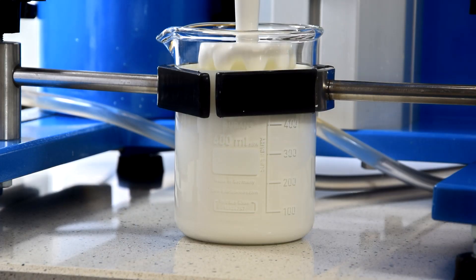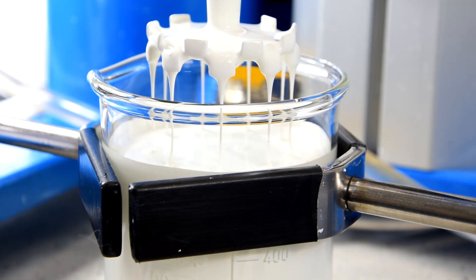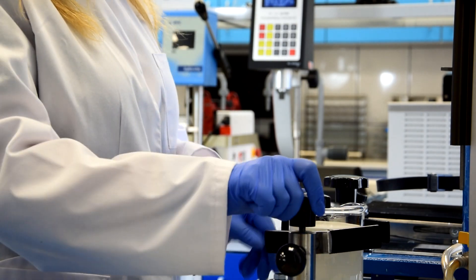Thickeners are very important additives in latex paint, ensuring rheology, workability, and improved stability over time. In the Spectrochem research laboratory, we know how important it is to provide guide formulations for latex paints with various doses of thickeners.